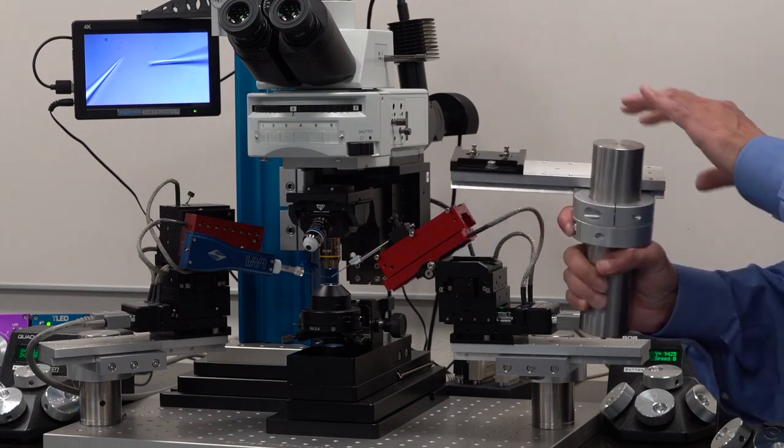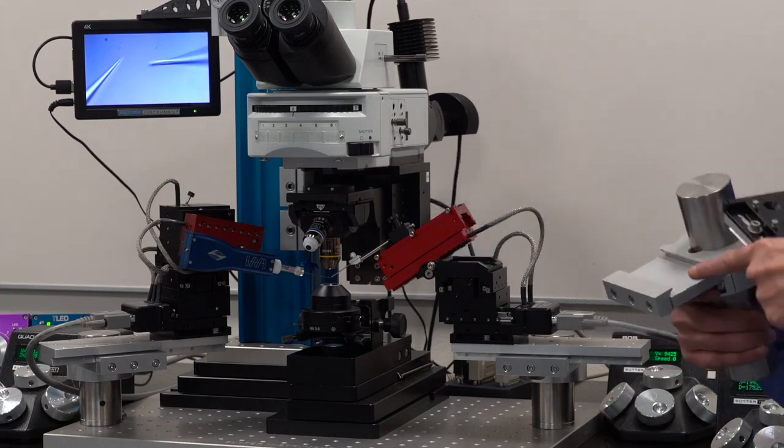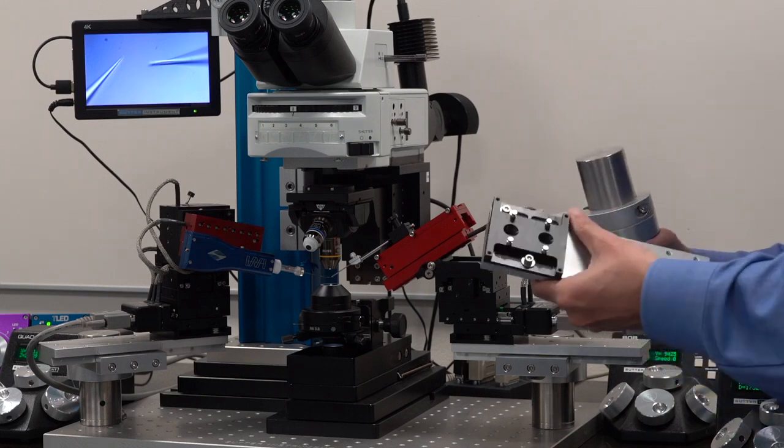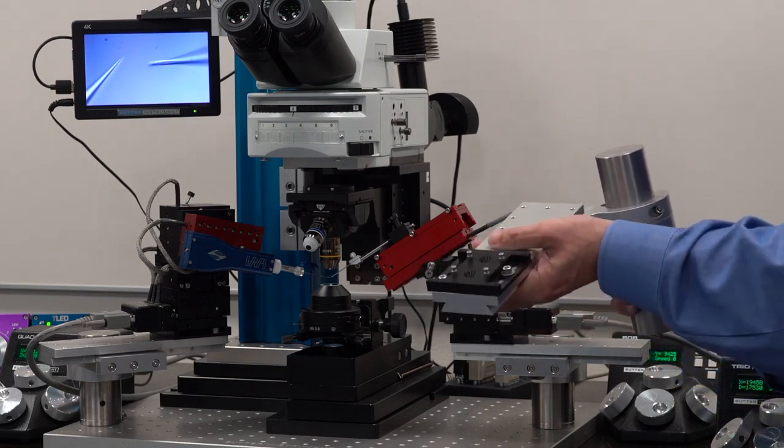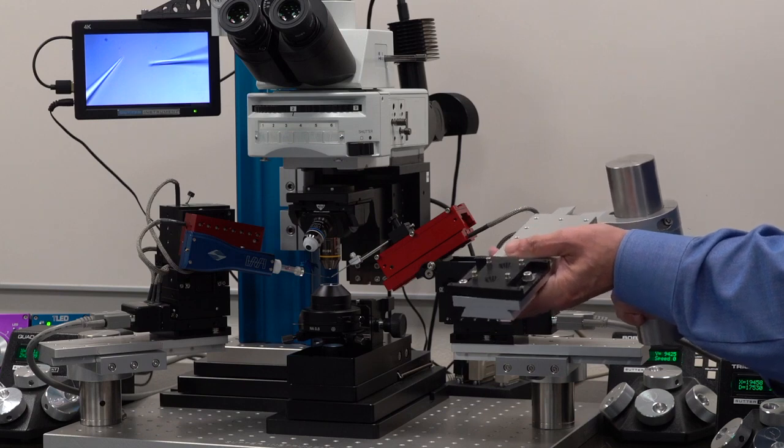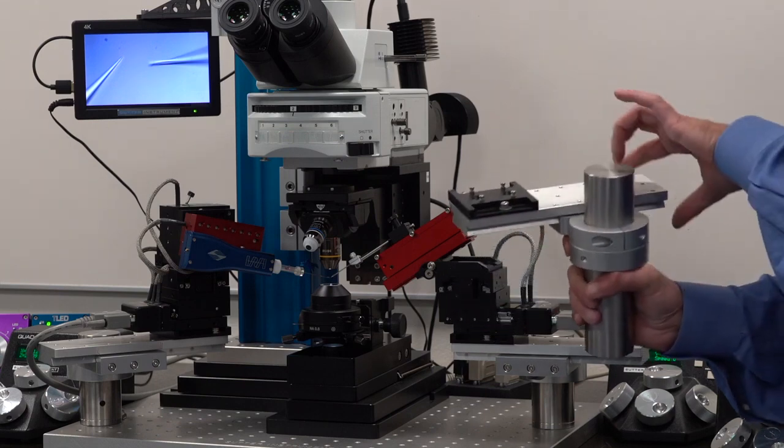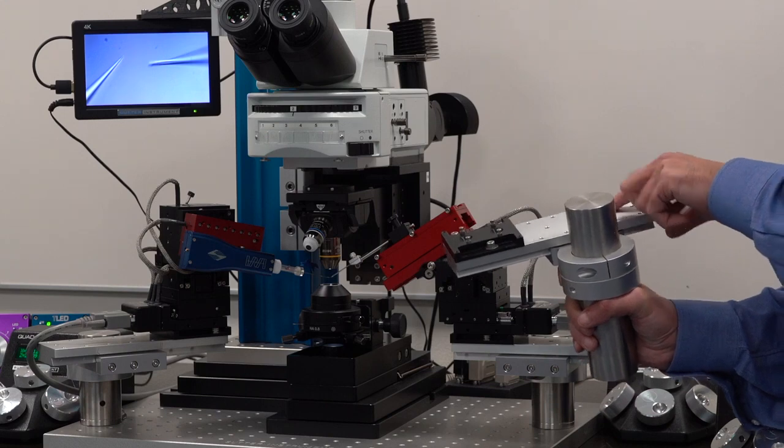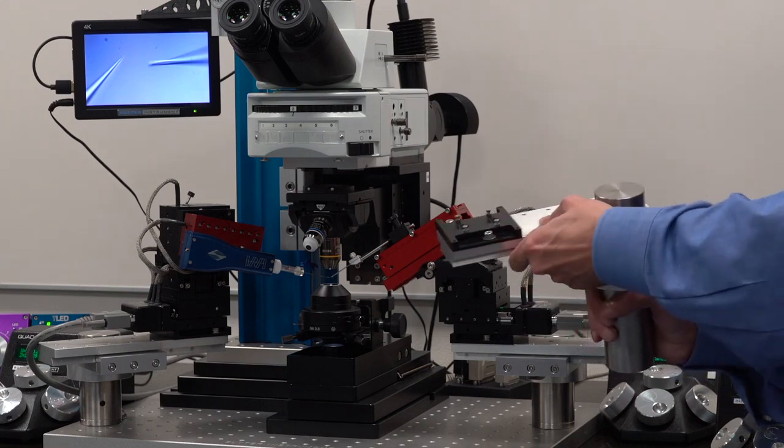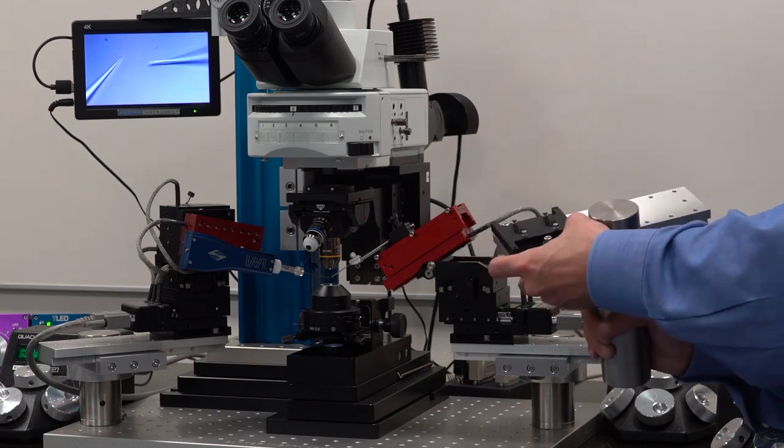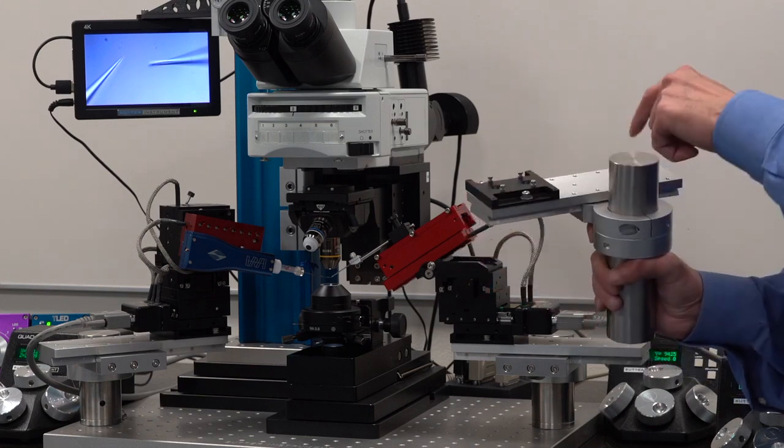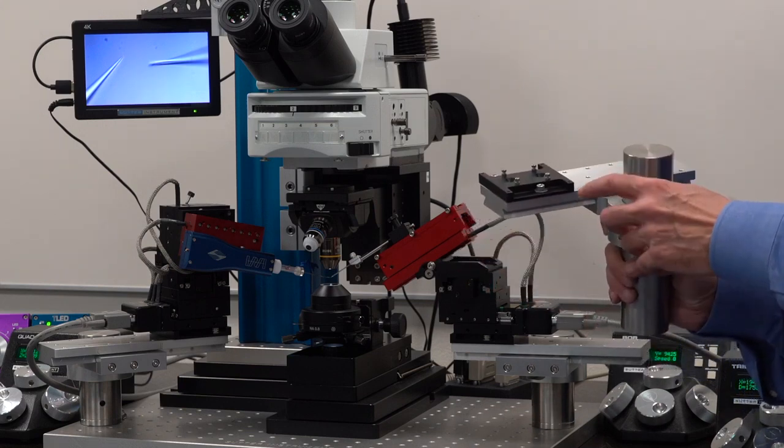By having this saddle, which we call this part the saddle, in like our old traditional towers, we can dovetail these gantries in and have them set at any X that we want. So that gives you all three degrees of freedom.